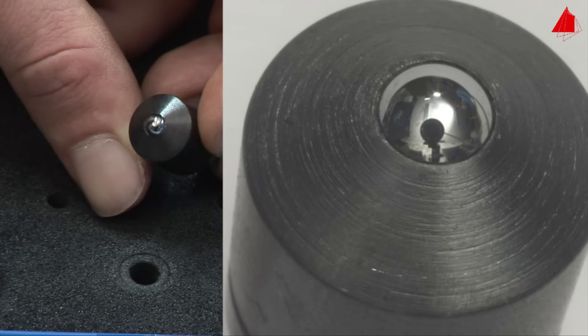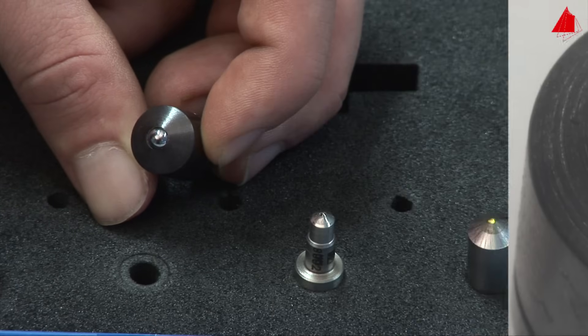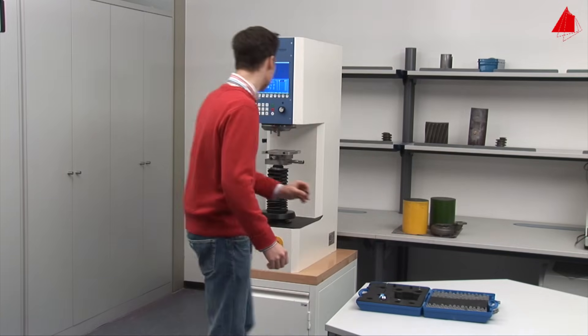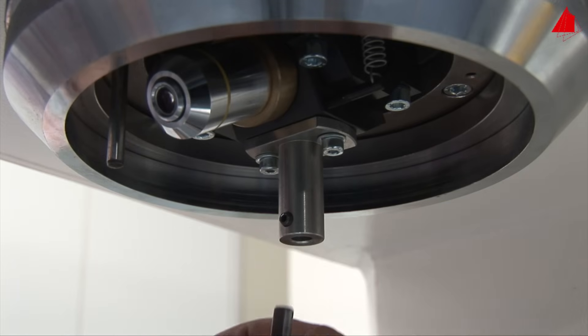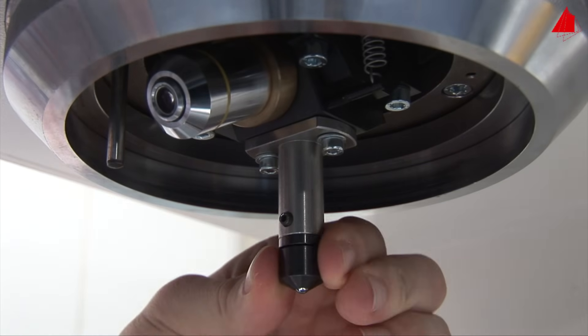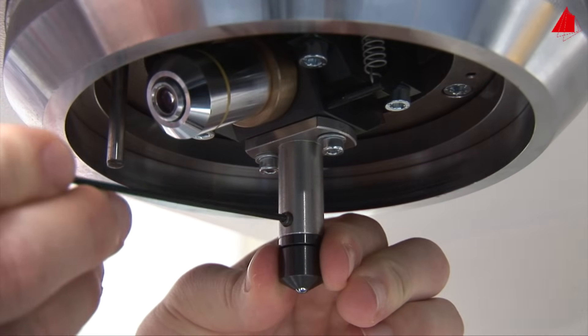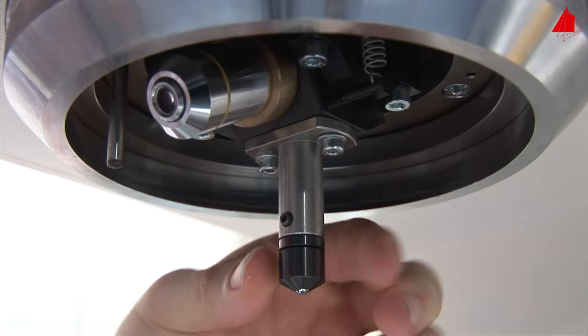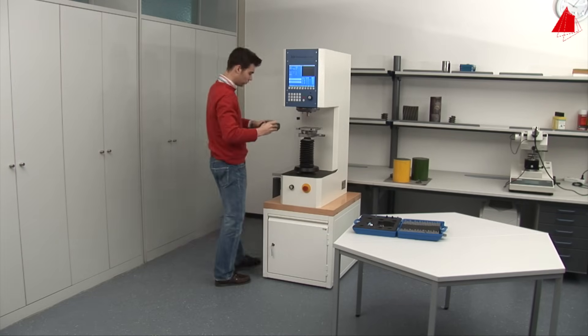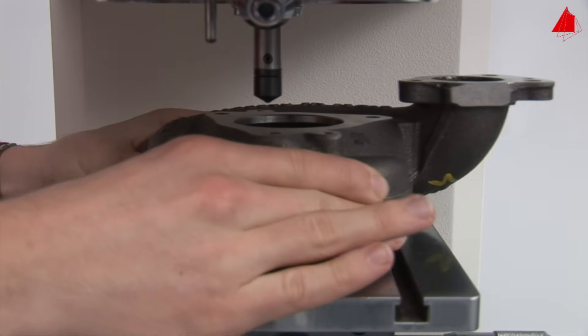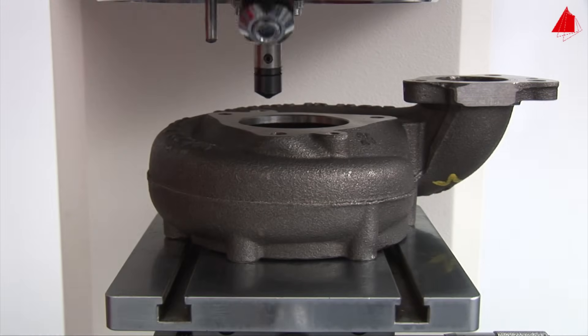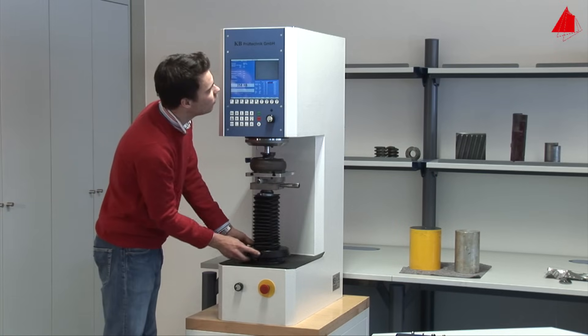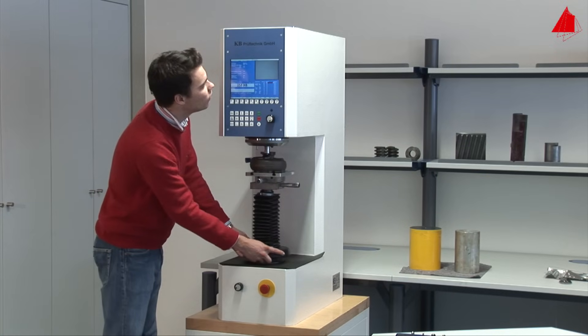The tester selects a suitable spherical indenter and inserts it into the holding device of the testing machine. Next, he puts the turbocharger housing onto the support table, rotates the microscope lens into vertical position and adjusts the correct height of the test piece.